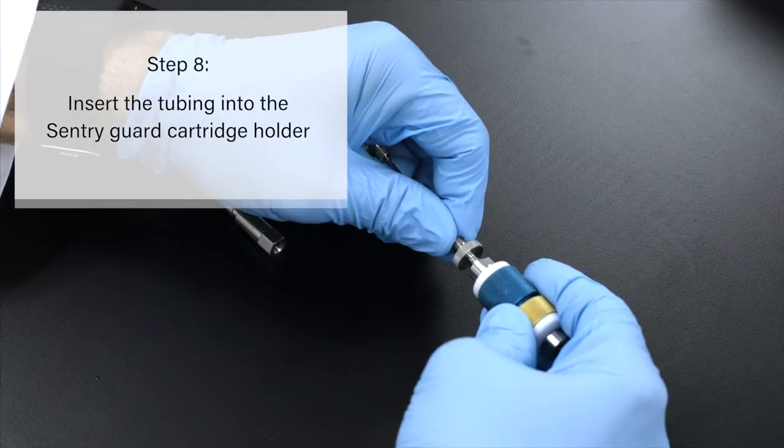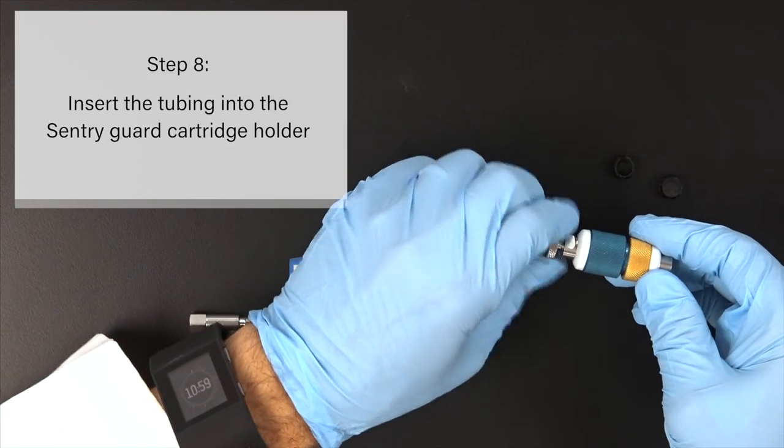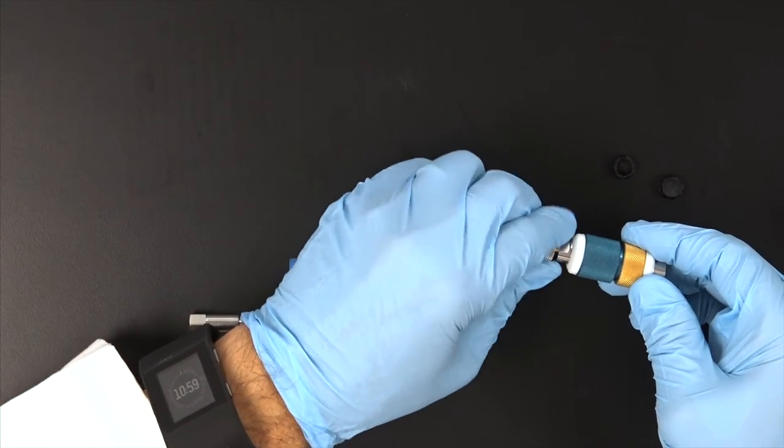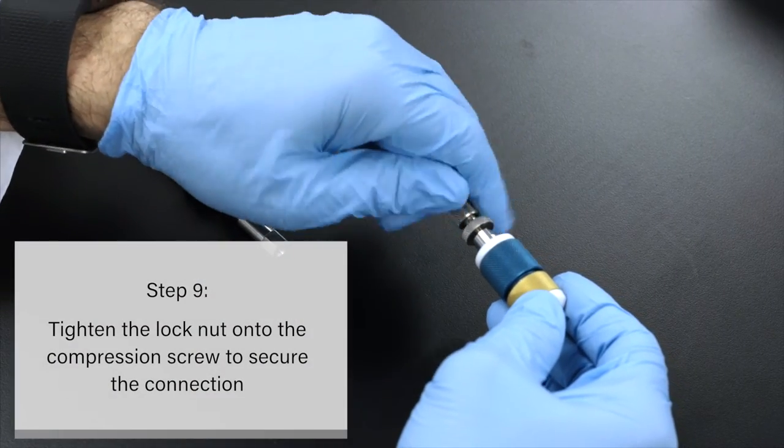Firmly insert the tubing into the Sentry Guard Cartridge Holder while tightening the compression screw until it is finger tight. Tighten the lock nut onto the compression screw to secure the connection.